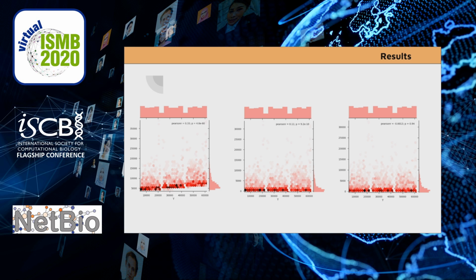Using background scaling, the effects of positional bias can be nearly completely eliminated. These plots show the correlation between the Y position of the array and probe intensity. In this case, a higher p-value, closer to 1, indicates a more effective reduction of positional bias. While background subtraction appears to be very effective at removing biases in most cases, the correlation between intensity and position remains very significant. Background scaling prior to subtraction completely eliminates this correlation in this case and many other cases.